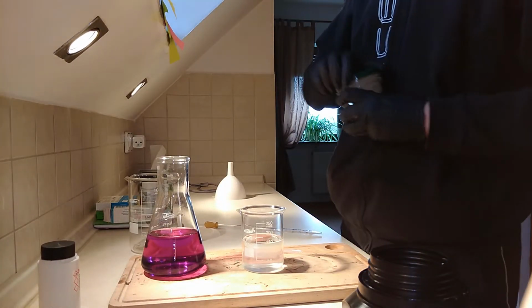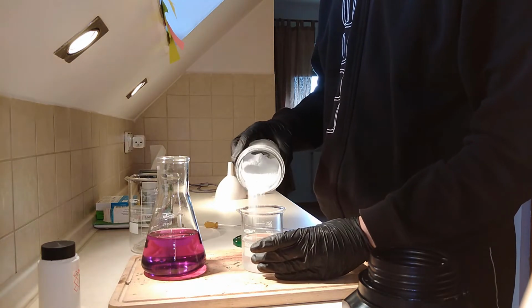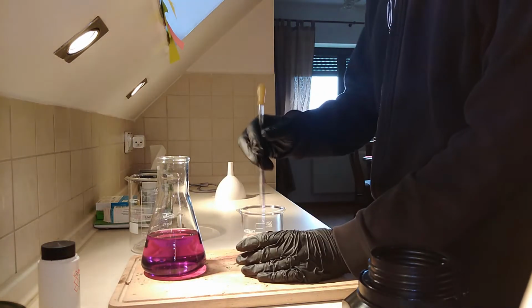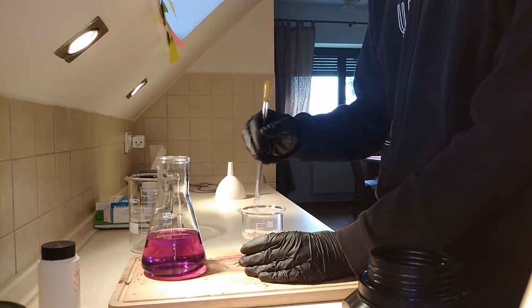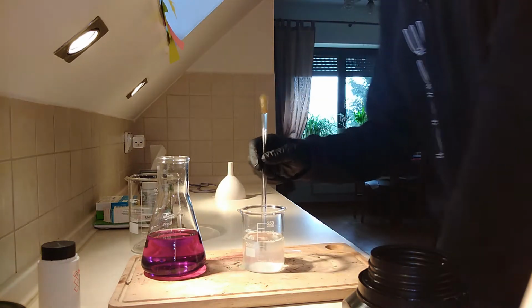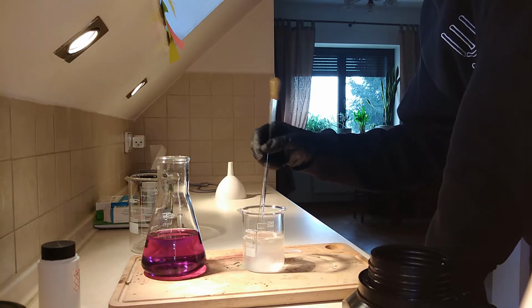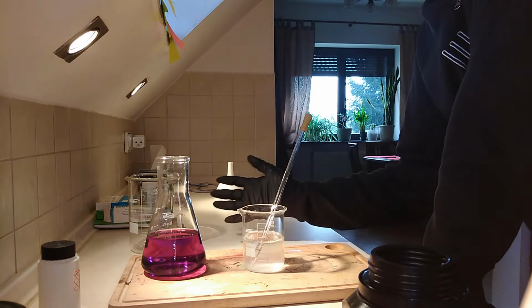So right now maybe the sugar solution. For this project amounts aren't that necessary. You just want an alkali sugar solution. First, the sugar. Obviously I'm saying don't use a pipette for stirring, but I'm using a pipette for stirring just because I broke my stir rod and I don't have money to buy a new one. So yes, I'm a broke chemist.